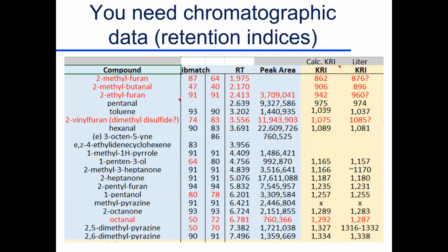There's going to be lots of compounds of interest, but we've got a benchmark in here. We know that this unknown compound is going to elute between the 7 carbon and 8 carbon hydrocarbons. And so you actually give that a number when you calculate and interpolate.